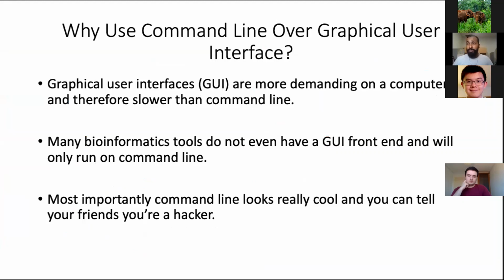Finally, many tools used in bioinformatics don't have graphical interfaces, or GUIs, and can only run on command line. This is the case for the majority of bioinformatic tools. Most importantly, though, command line looks really cool and you can tell your friends you're a hacker.